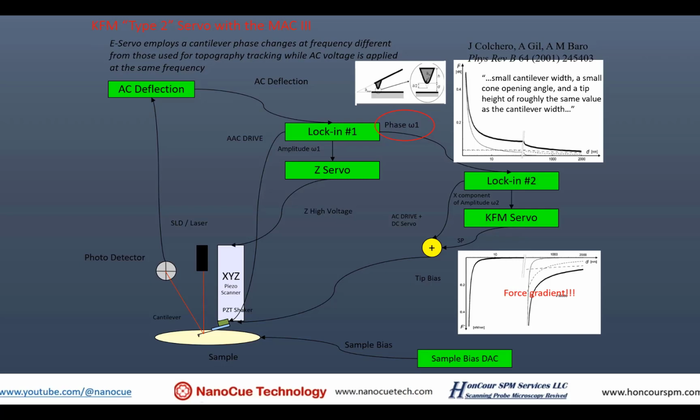Yeah. So even when I do the FM, I always run the AM first and then run the FM and then try to push the resolution. It's in the application. I'm a chemist. I don't understand the signals as much, and it's a struggle to read those. But in applications, yes, AM is much easier to do, and FM needs a very, very flat sample.